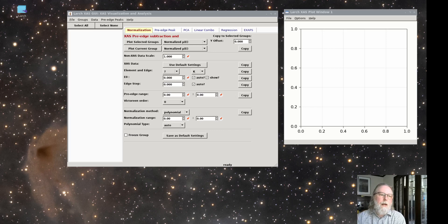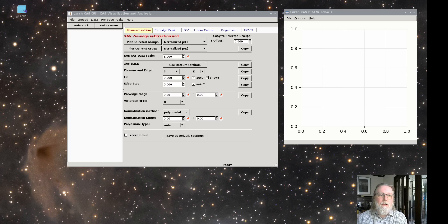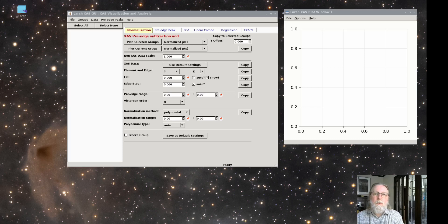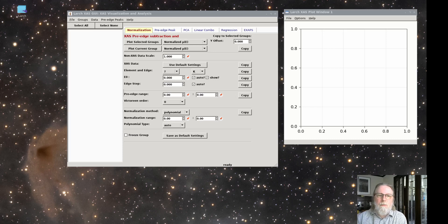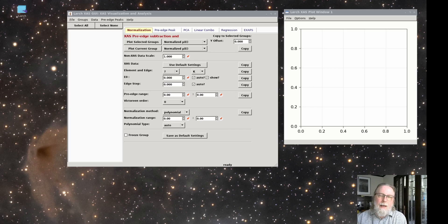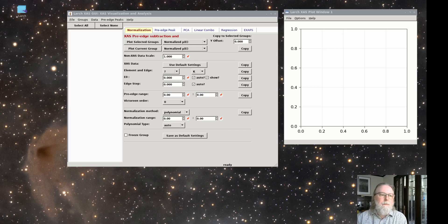And with these steps, we isolate the absorption coefficient, mu of E, for the edge of interest as well as the absorbing atom.